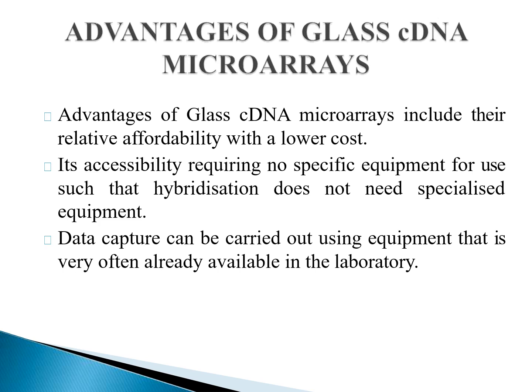And finally, data capture. Now, the data capture can be carried out by using equipment that is very often already available in the laboratory. So here you can use the fluorescence microscope also for the capturing of the data, which is usually available in many of the laboratories working in the field of molecular biology.